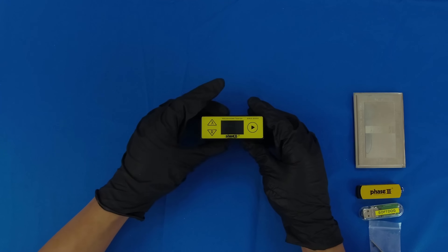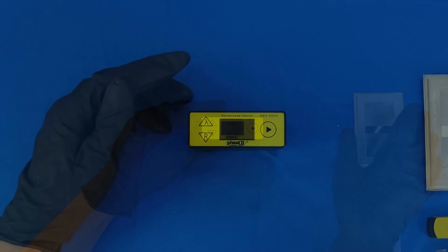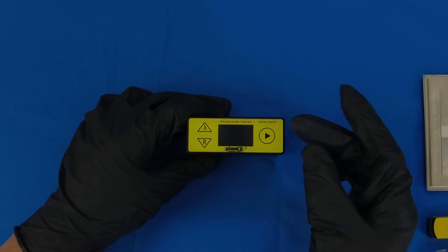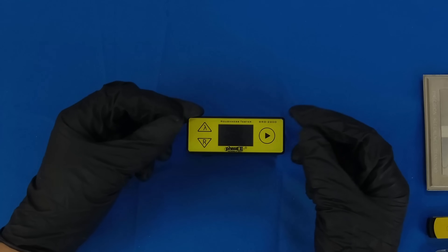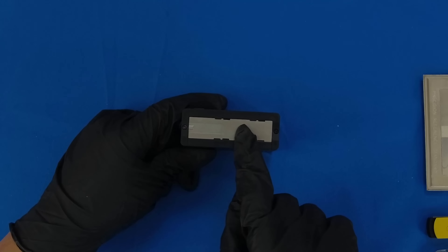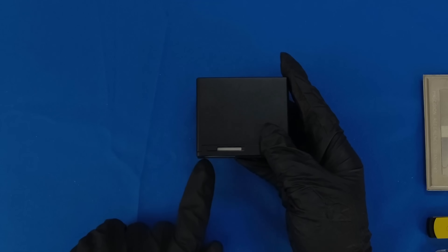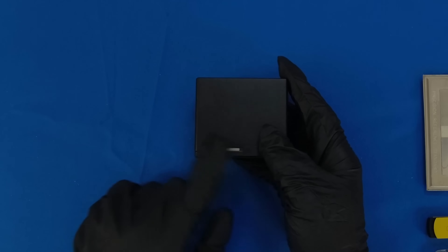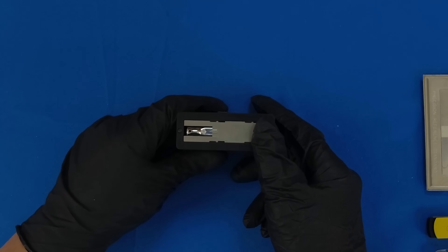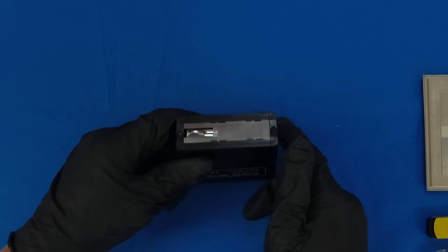Now, let's take a closer look at the actual function of the SRG2200. Zooming in, we can see that we have a display along with all of our controls located at the top. At the bottom is a stylus and a stylus cover. The stylus cover can be removed by sliding this toggle to the rear, which will expose the stylus and allow it to read samples.